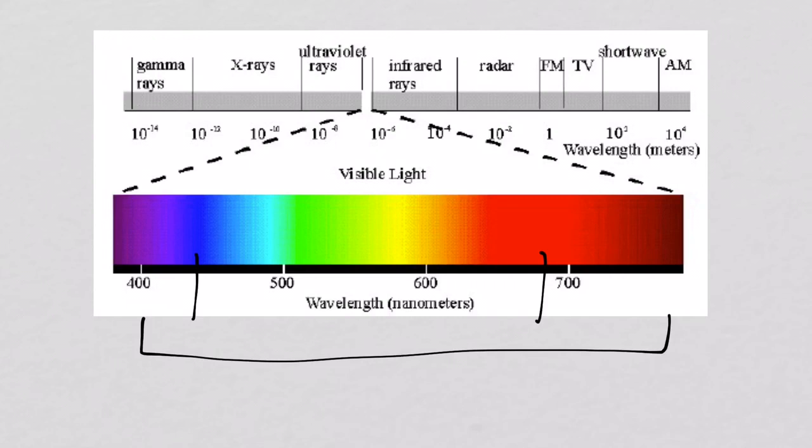And you said something very important. It absorbs predominantly wavelengths that are not green. That's why we see it green. That's the one that is not absorbed.